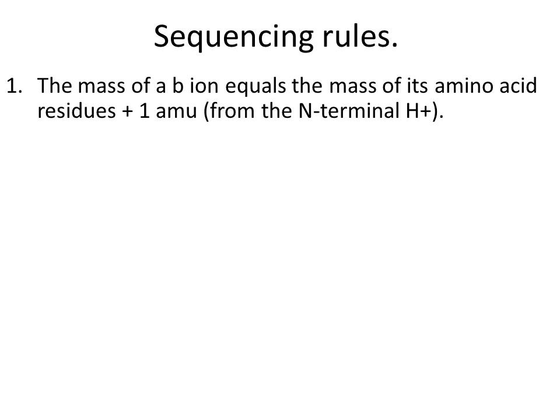First, a B ion's mass will be the sum of the amino acids in its sequence plus 1, the mass of a hydrogen ion. The N-terminal, or B1 ion, will be somewhere between 57 and 186 Daltons, the mass of the lightest amino acid glycine and the heaviest amino acid tryptophan. It will be the amino acid mass plus 1. The largest B ion should be found somewhere between 57 and 186 below the mass of the intact peptide.